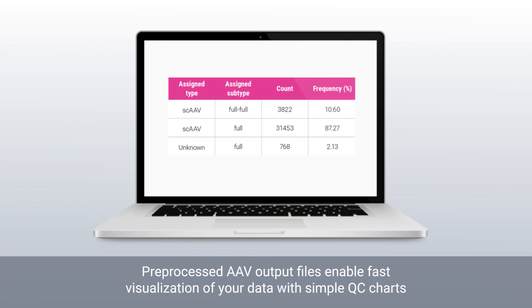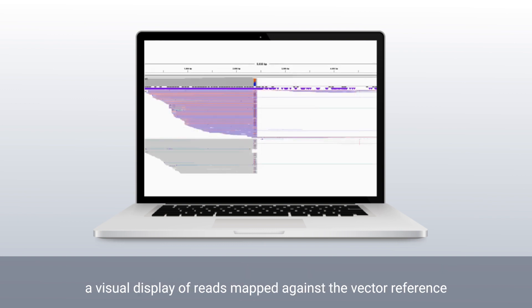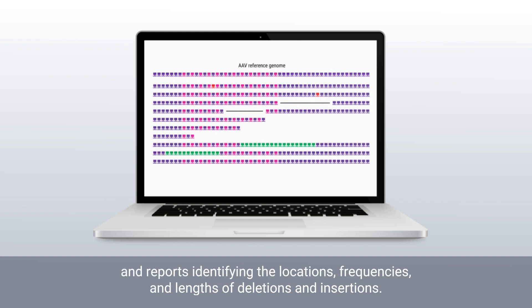Pre-processed AAV output files enable fast visualization of your data with simple QC charts, including the proportion of sequenced vector with the target gene as opposed to contaminants in the ITR to ITR region, and a visual display of reads mapped against the vector reference.